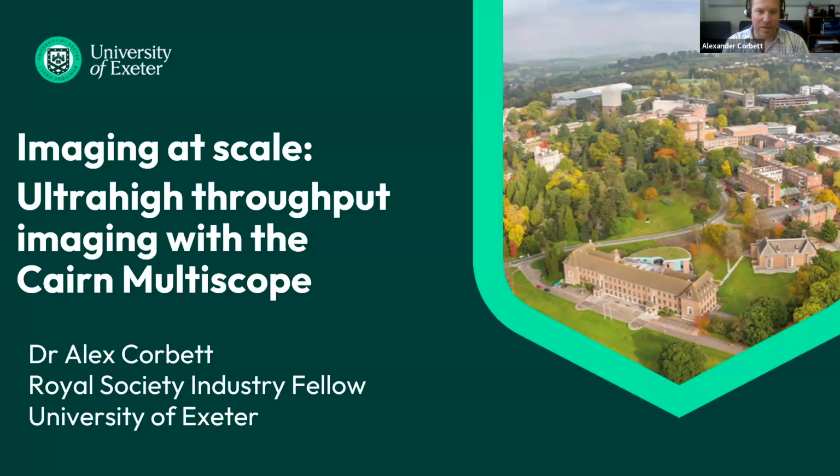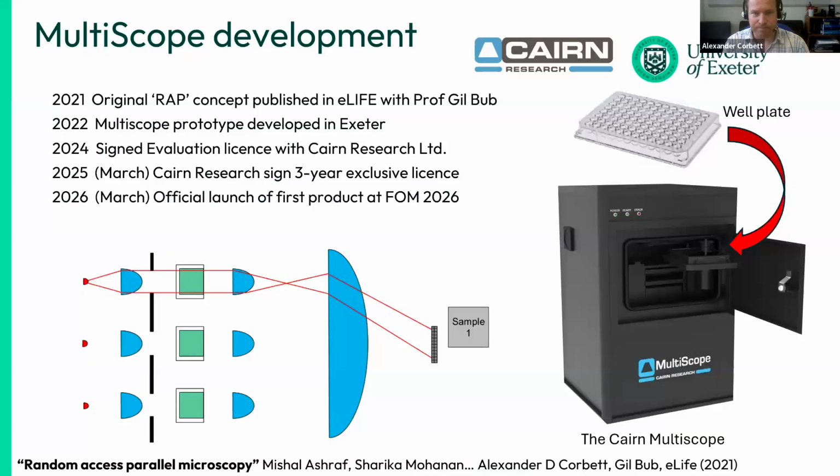As introduced, I'm Alex Corbett. I'm a Royal Society Industry Fellow, full-time academic at the University of Exeter, but I'm giving this presentation on behalf of Cairn Research, who have created the commercial version of this technology.